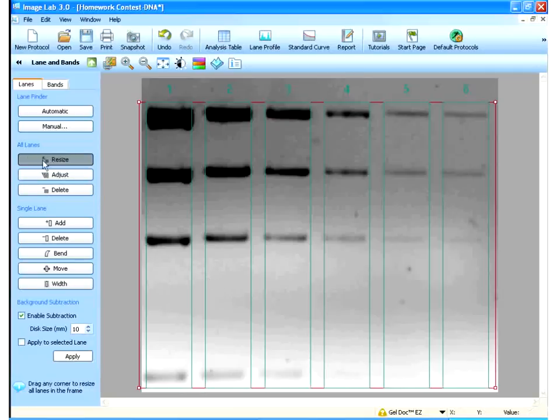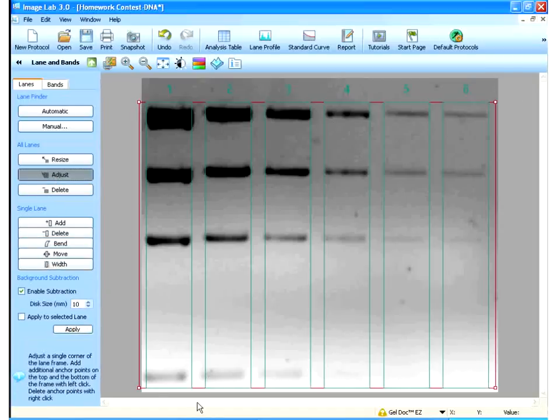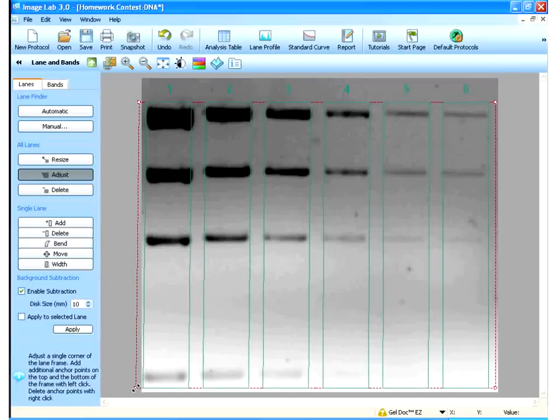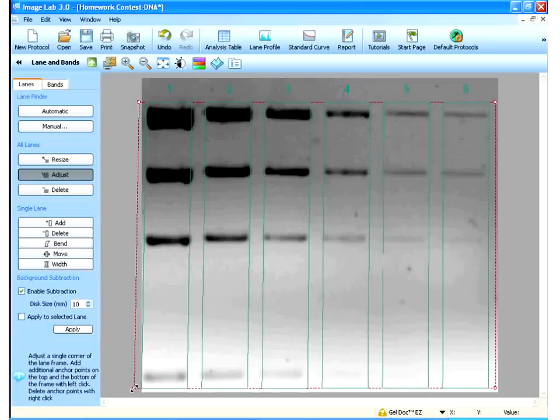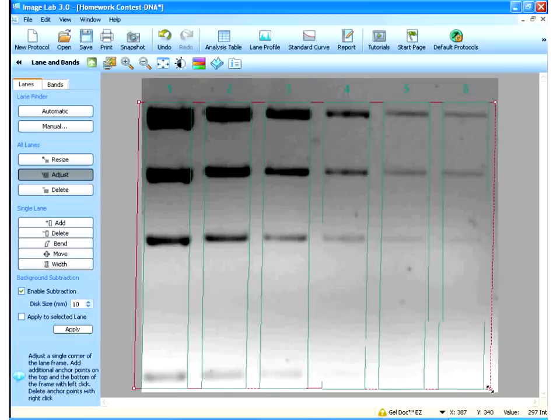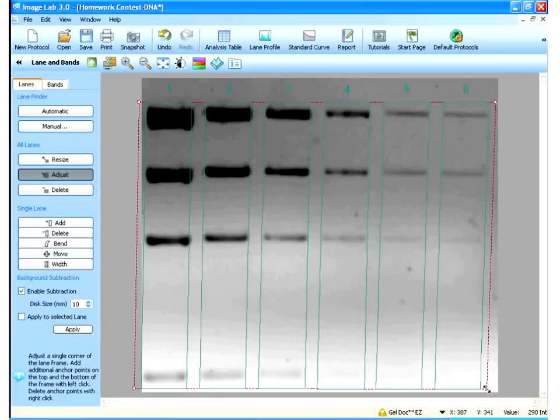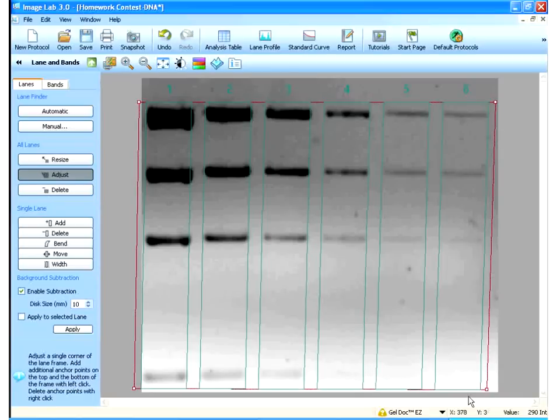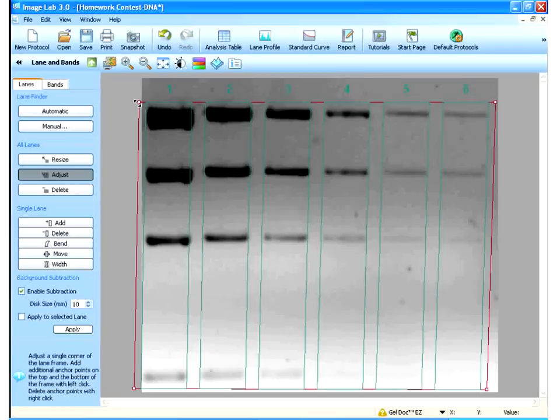This is, I've already resized, so it moves to the All Lanes tools and it's resized the lanes because I stretched the lane tool. If I go to adjust, I can now adjust and bend the lane somewhat to fit the contour of my gel. Do you see what I did there? So, it's kept this part sort of the same and it's bent down here to fit these lanes.